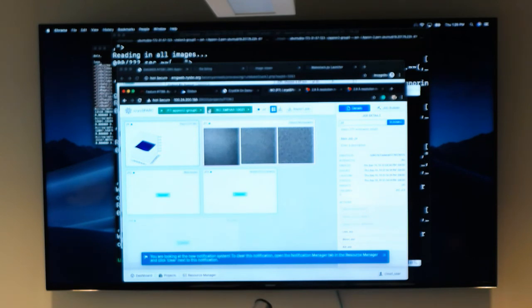Because I don't know if I have an issue. Is it replicating the particles? No, I don't know. Let's see. I would have to go into the documentation to see how it's doing that. I was under the impression that it would use the same number of particles to enforce this symmetry. Who knows? You never know.